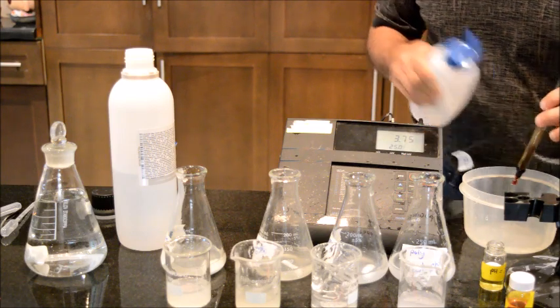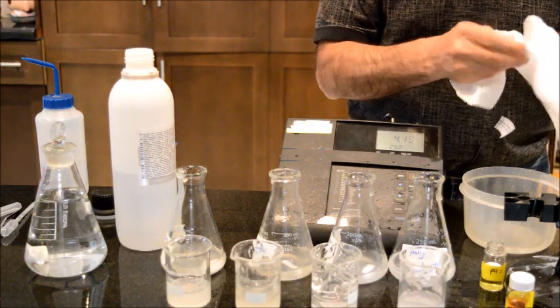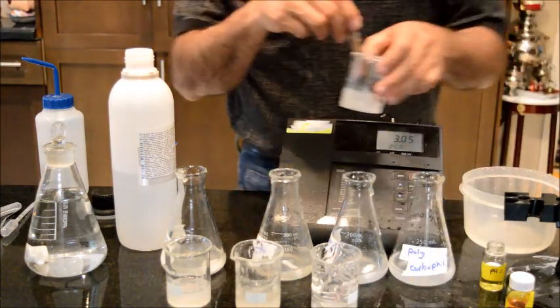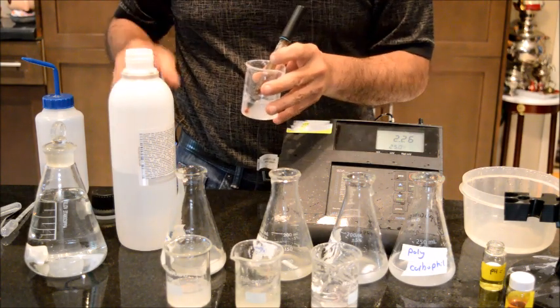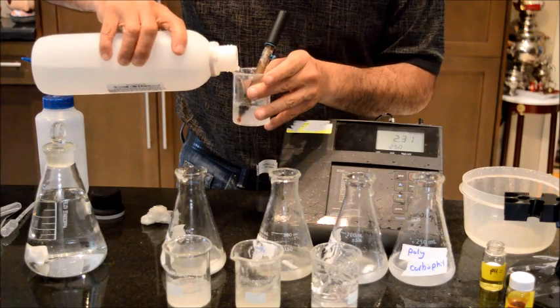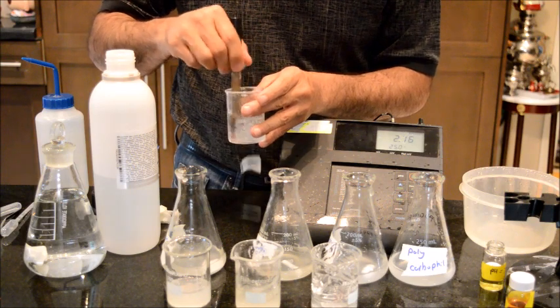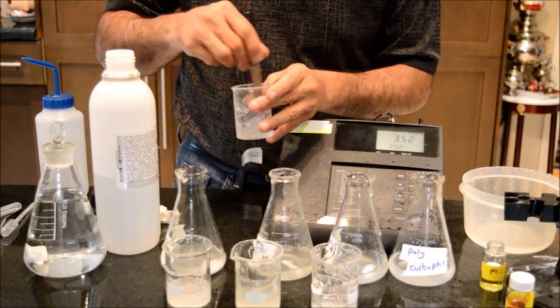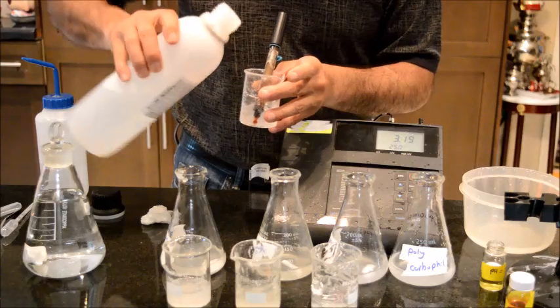And I'm going to do the pH adjustment of the last gelling agent, which is Polycarbophil. I'm going to lift it up close to myself so it's easier to work. The pH is as is, again, pH 2, and I had maybe too much sodium hydroxide, but this Polycarbophil is behaving similar to the Carbomer.